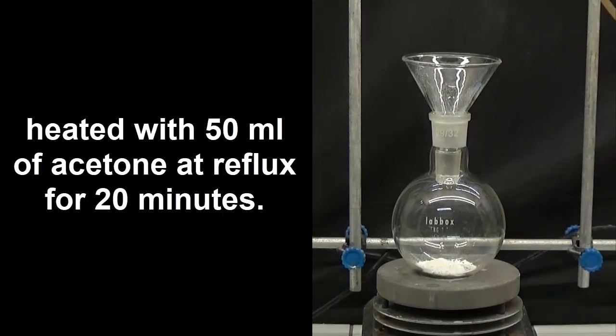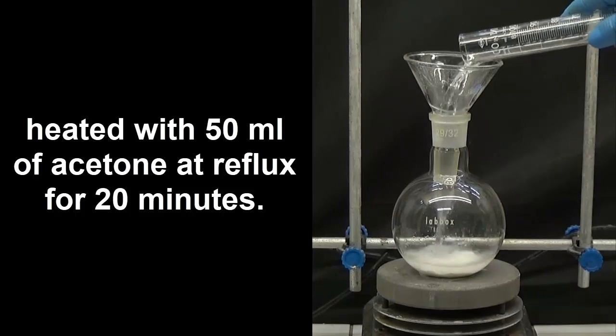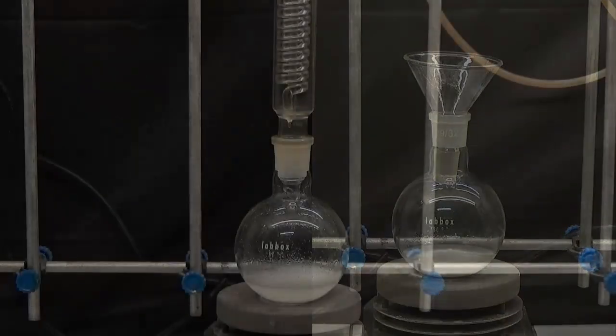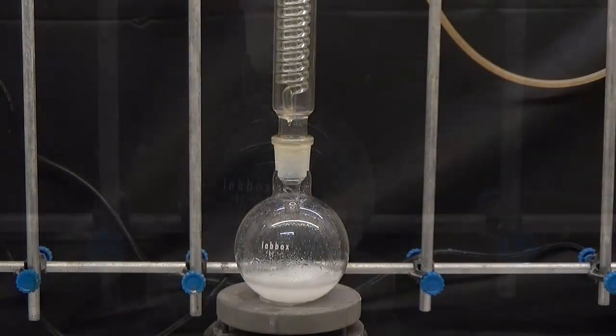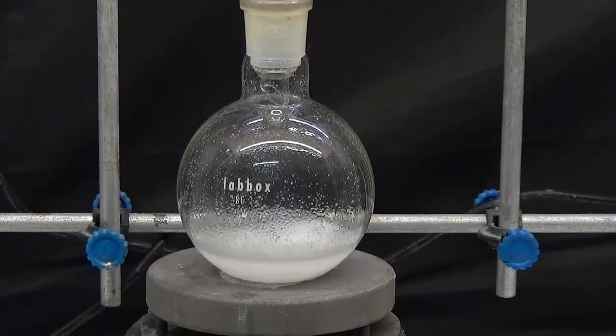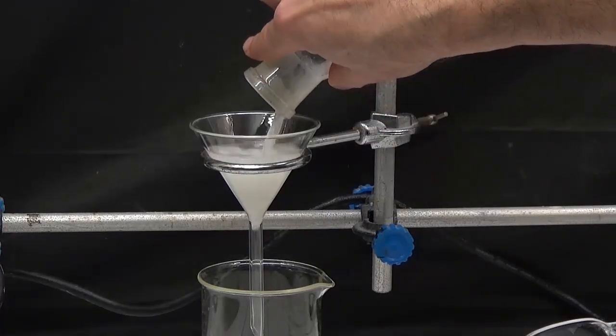The crushed powder is heated with 50 ml of acetone at reflux for 20 minutes. Let cool and filter for removal of insoluble materials.